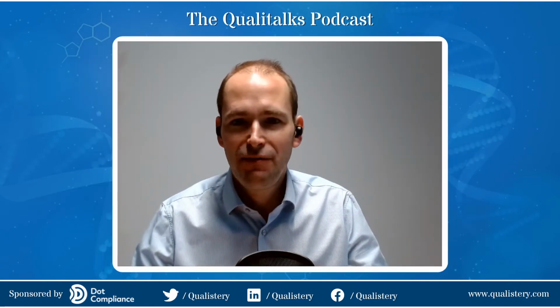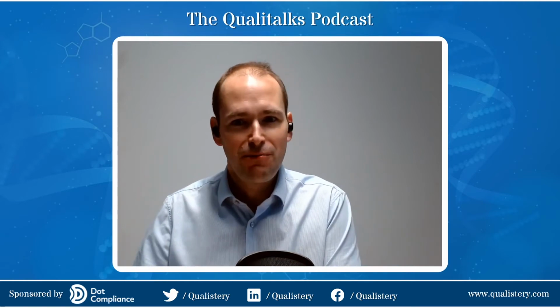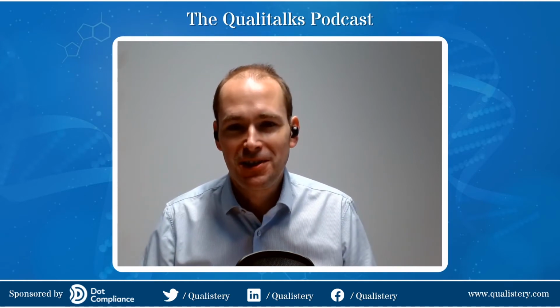Exactly. So what are the biggest issues or mistakes that companies make when they purchase autoclaves? You mentioned once that they look at the budget that they have and then buy according to the budget instead of the direct use requirements or their processes. Is there anything else that people should be aware of when they're choosing them? Well, yeah, I guess the budget is more it's an autoclave, so we'll buy that one. We have X amount of money to spend. That's how the purchase decisions are often made.